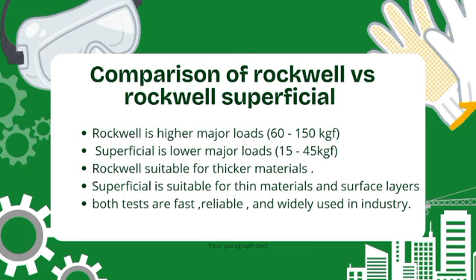And next, the advantages and limitations of the Rockwell hardness test. Advantages are a quick testing process and direct reading of the hardness number. Minimal specimen preparation is required. Limitations are that it is not suitable for very thin materials, and surface condition may affect accuracy.